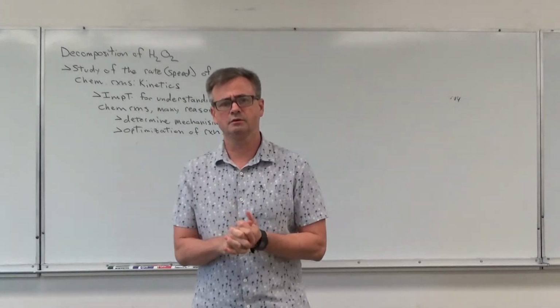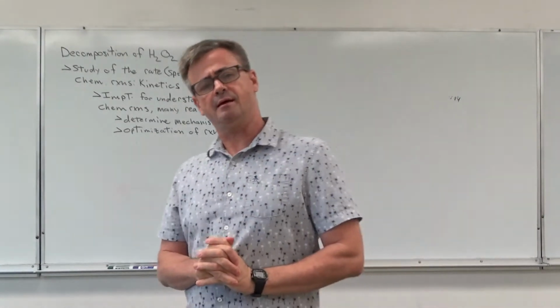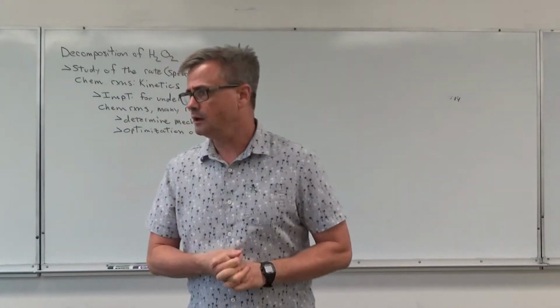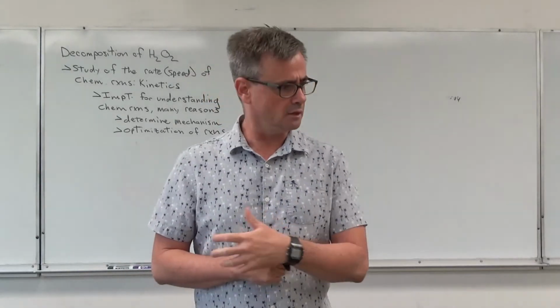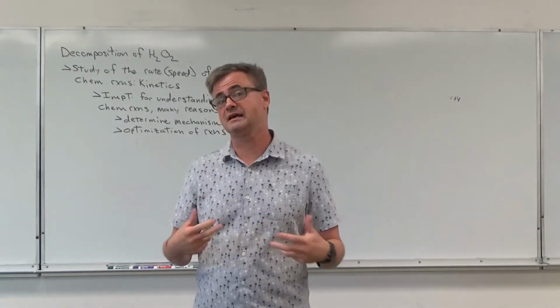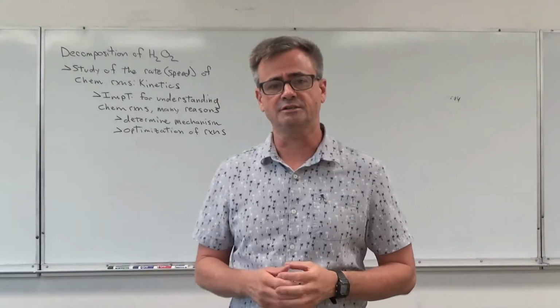Howdy folks! Okay, so the long-awaited pre-lab for decomposition of hydrogen peroxide. It's the second lab in our lab series that deals with kinetics. And kinetics is the speed of reactions.